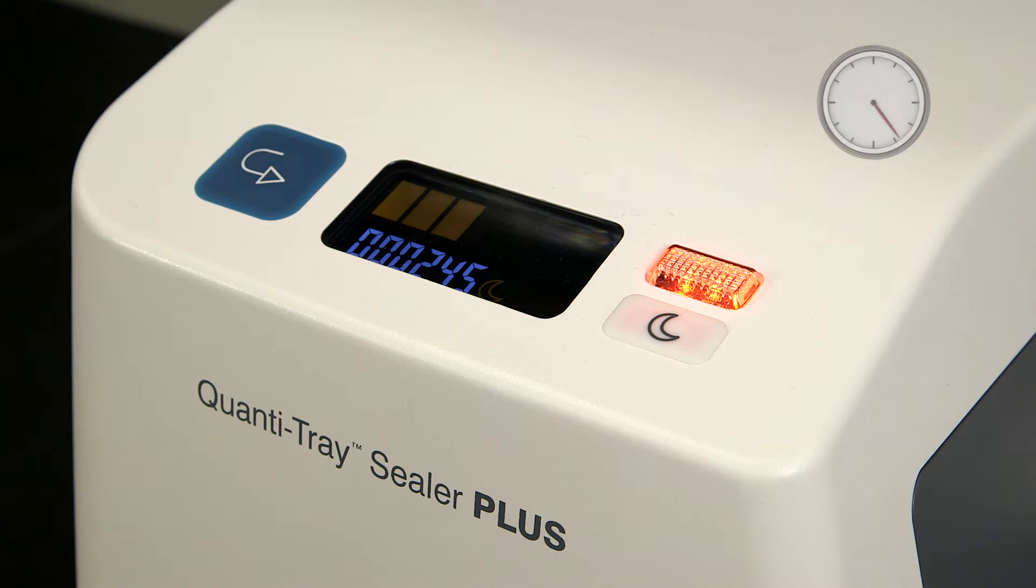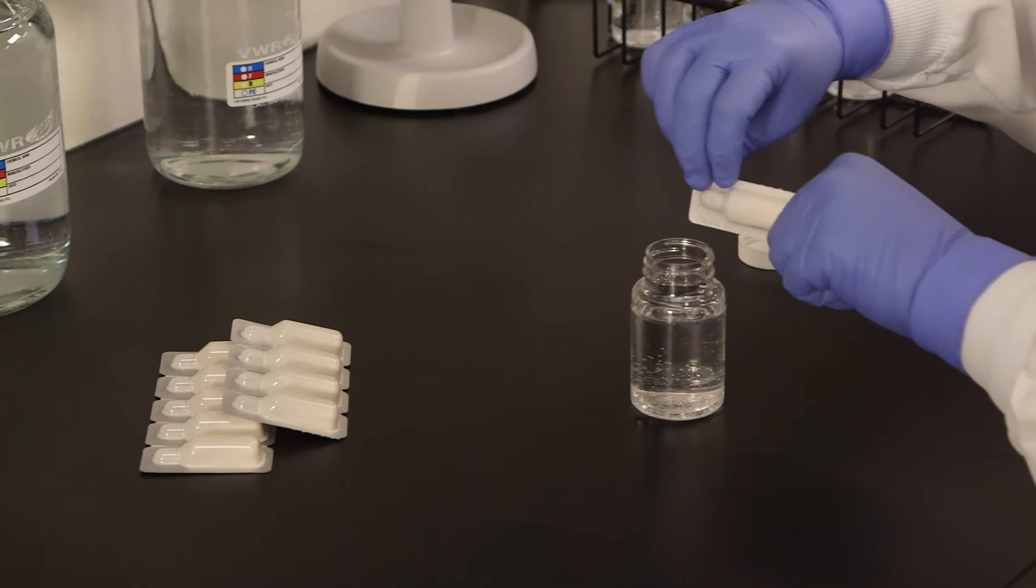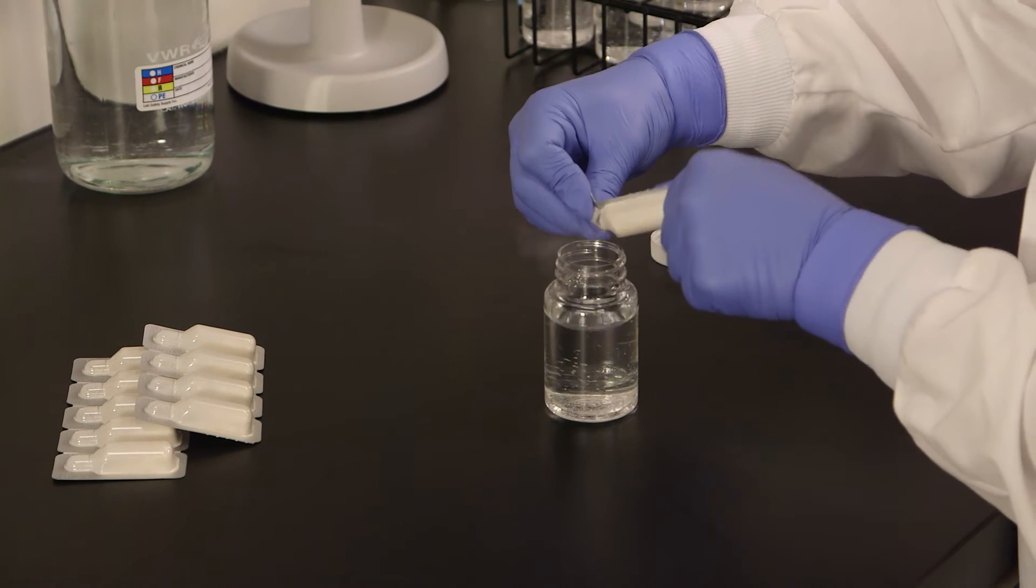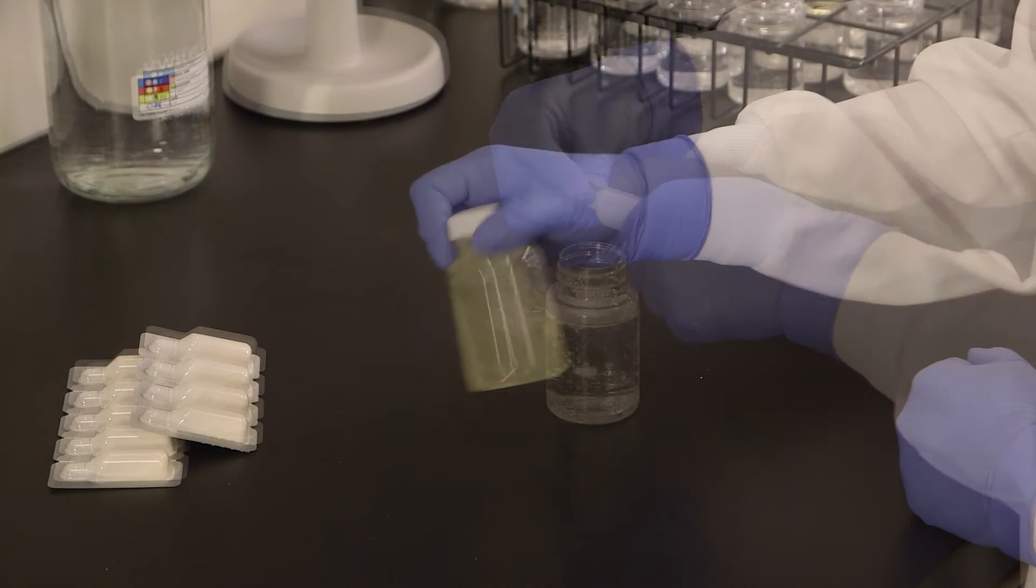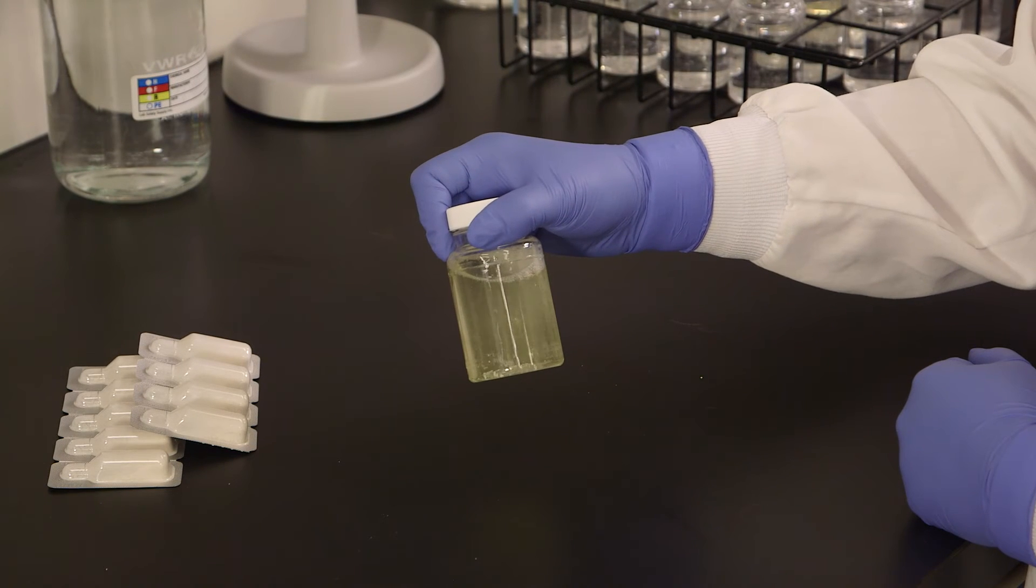Turn on the sealer and then wait until a green bar appears on the display. The sealer has now reached the appropriate sealing temperature. Add the Enteralert powder to a 100 ml sample and cap the vessel. This time, shake until the reagent dissolves completely.